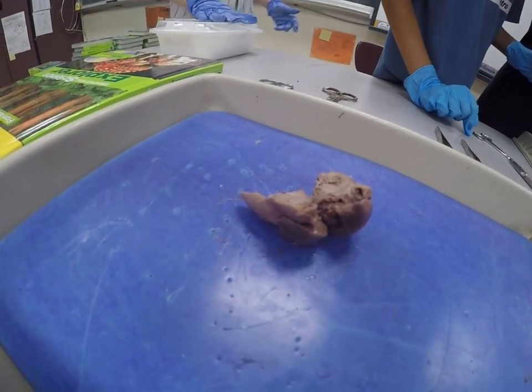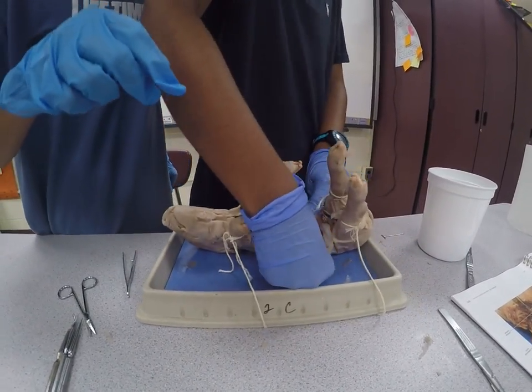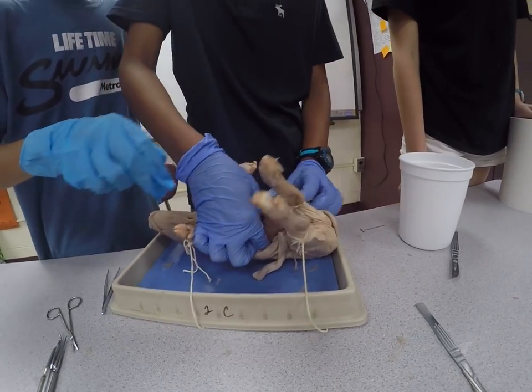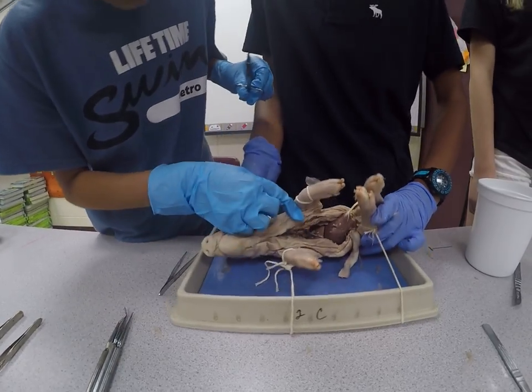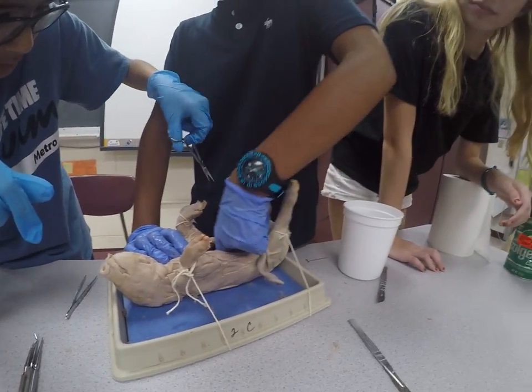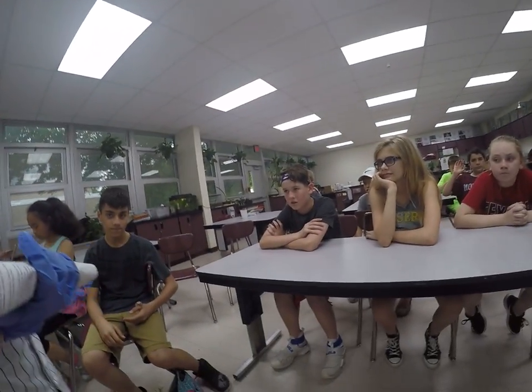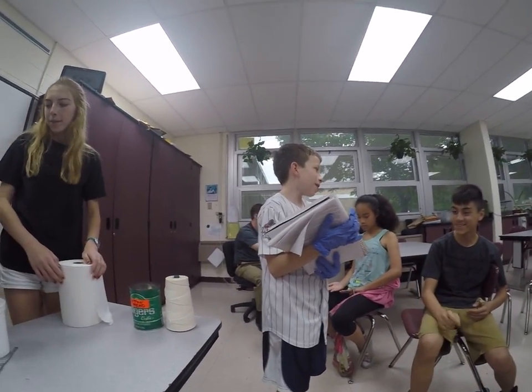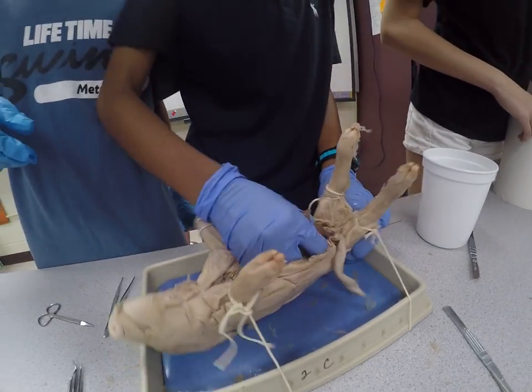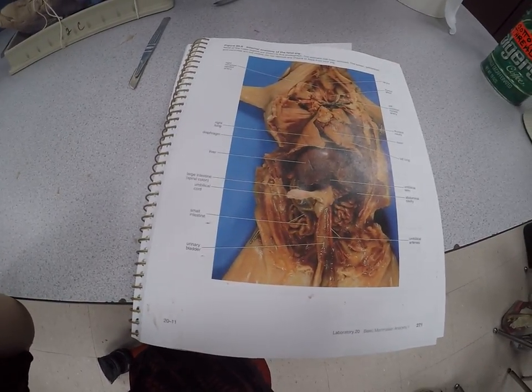We're trying to find the heart but it's hard. We're trying to pull out the liver — it's really big and hard to determine if this is the liver or bladder. You have the liver here and right below it, normally hidden, is the urinary bladder. We believe it is the liver because it is quite large and reddish-brownish. Do any of you know what the liver does? It filters the blood — it filters out blood sugars so that you have perfectly good blood for your entire body to use.